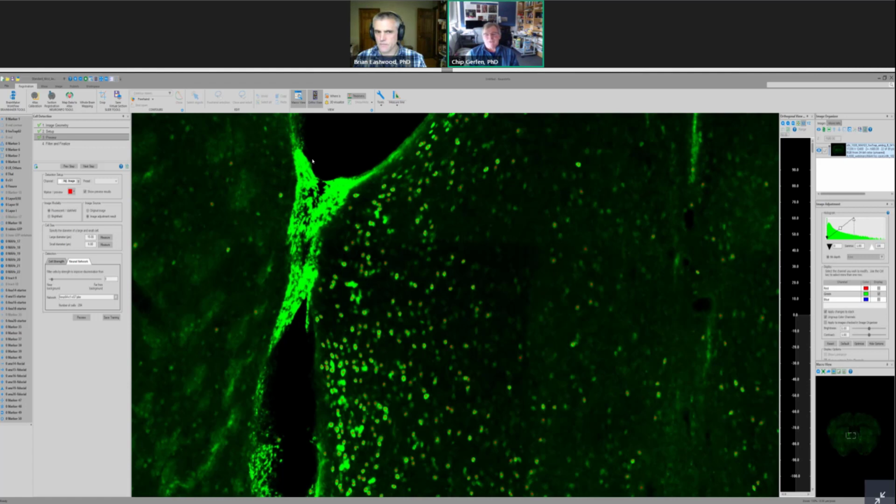So another option when you're analyzing FOSS is you can detect at different levels of intensity, or change the histogram. Another way is that there's an intensity value associated with each neuron or each object that's been detected, and that can be done after the fact as well. Anyway, Brian, have I forgotten anything?